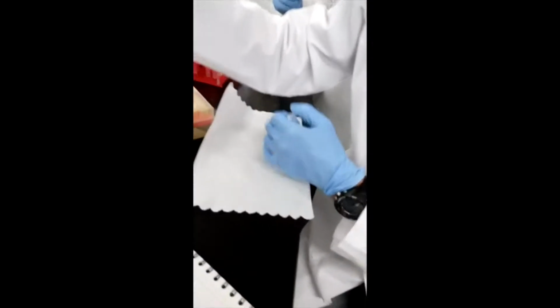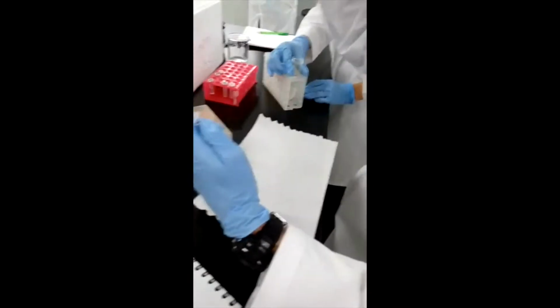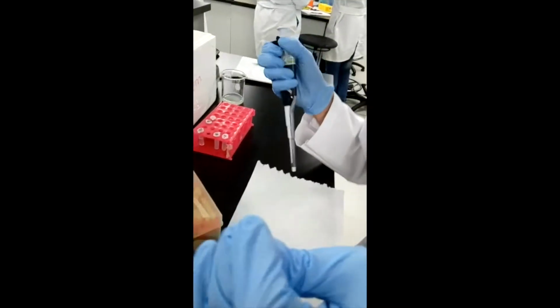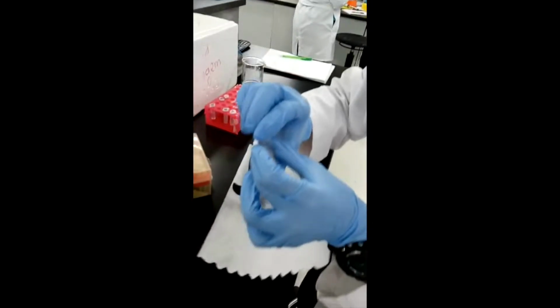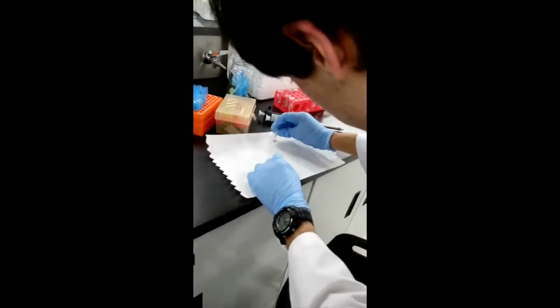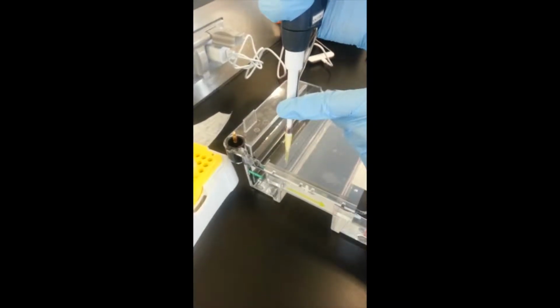Our sample had an almost trustworthy pureness. It may be a little contaminated with proteins. Comparing the results of the electrophoresis and the ones obtained with the spectrophotometer, we can see that in both cases there is contamination of proteins. One of the samples is degraded and both of them could be a little contaminated with salts, as you can see at the top of the electrophoresis results. So in general, the spectrophotometer results and the electrophoresis results are equal.